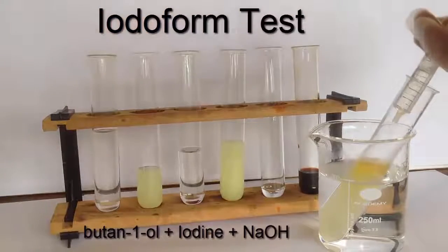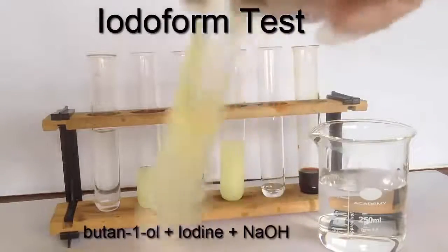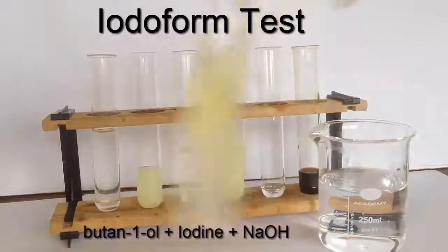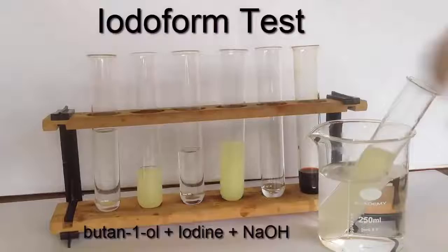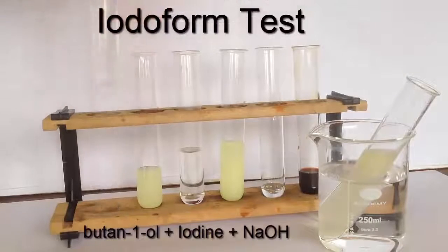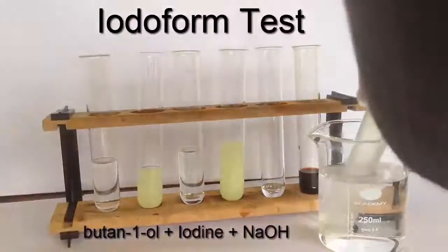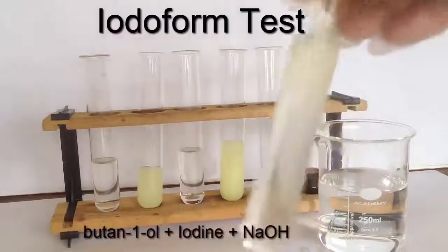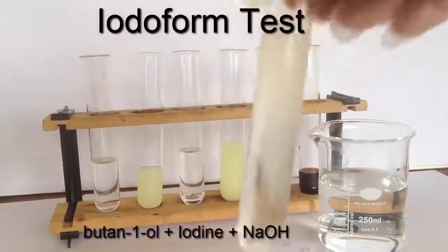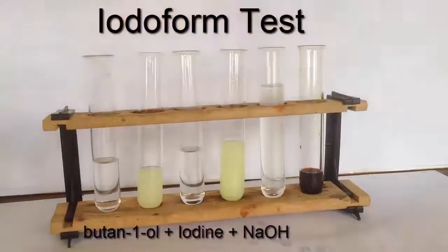And I did add a good bit more sodium hydroxide to get a result. I needed either it to go colourless and clear, or I needed it to go yellow and cloudy. I wanted one or other result, so I kept adding sodium hydroxide and warming it in the water bath. In fact, I found I had to add even more sodium hydroxide to get one result or other. And at this stage I was convinced that it wasn't the yellow precipitate. Certainly no yellow precipitate there. And at the bottom you can see it has gone colourless and clear.